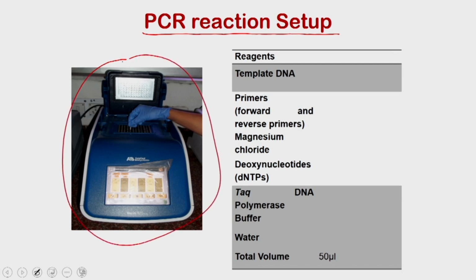We have already discussed the different components of thermal cyclers, and we have also prepared a very small movie from the thermal cycler available in our laboratory. In that small clip, the students are going to show you the different components present in a typical thermal cycler, such as the reaction vessels, or the place where you are going to keep the reactions, the heating block which does not allow the evaporation of the sample, and the different types of buttons available for different types of operations within the machine.